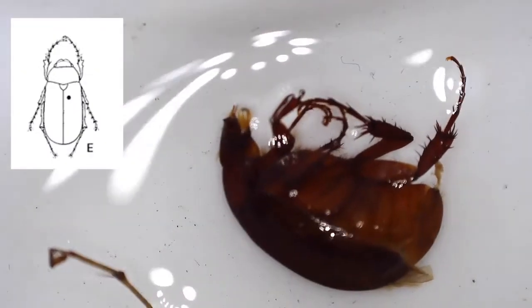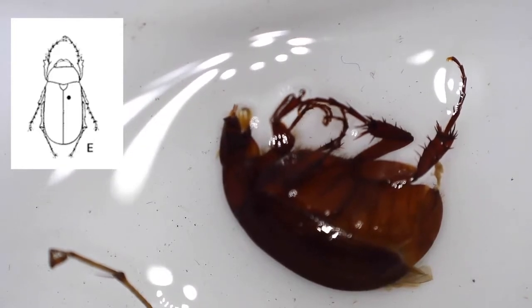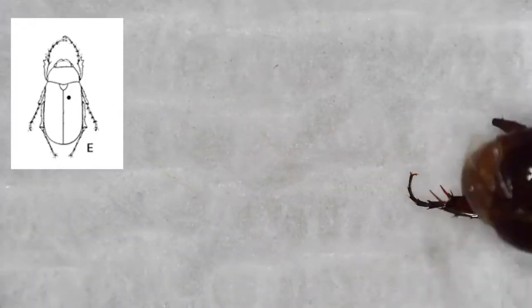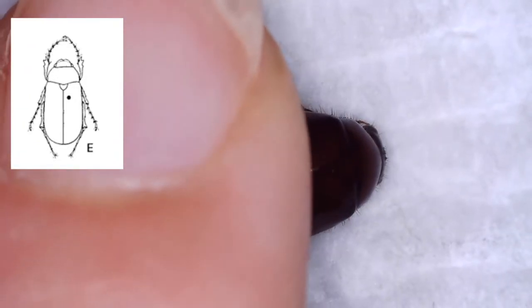Hello students, in this video I'm just going to give you a little bit more guidance about pinning, starting with a beetle that you see there that I collected in a malaise trap. I'm going to dry off this beetle since it was in alcohol by giving it a quick rub down on some paper towel, and then I'm going to try to pin it.